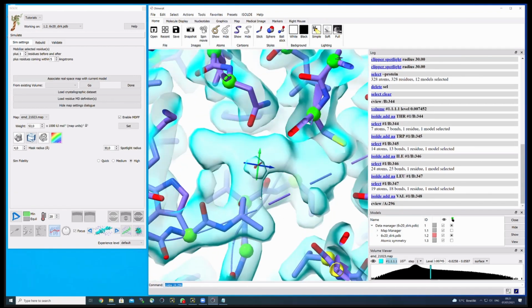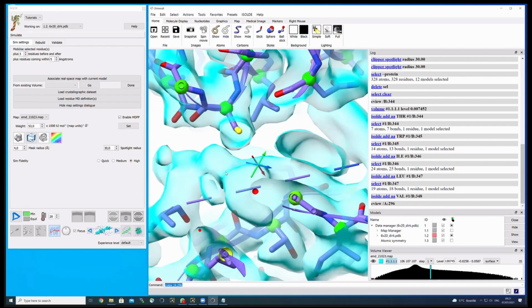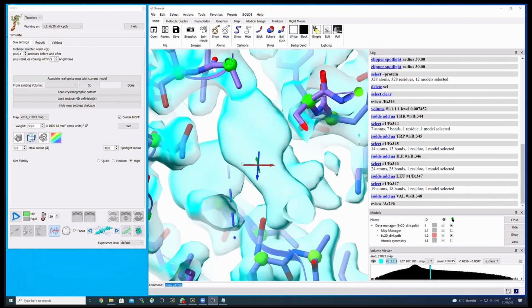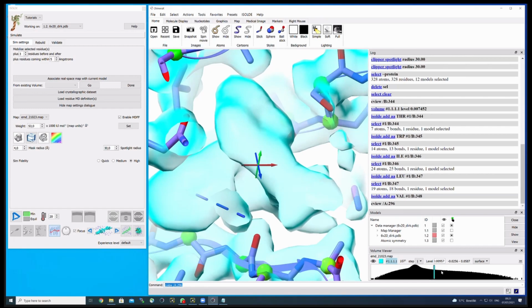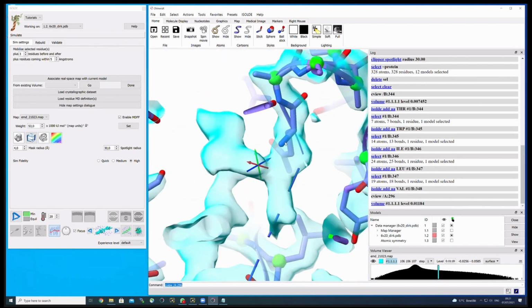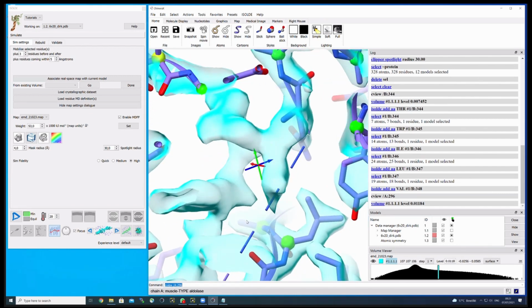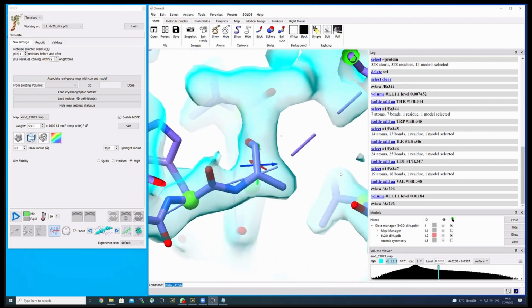And what I did here is, of course, this is what I engineered. This was modeled correctly before, but I deleted a stretch of 10 amino acids, and we can basically follow this chain, how it runs through the protein with its density. Some really, let's say, marker residues are here, which is a tyrosine here. You can start seeing the whole, especially if you play around a little bit with the threshold. You see a phenylalanine here, so some really nice marker residues, and it continues just to this end terminus. And this is also indicated by the dashed line, which in ChimeraX highlights a pseudo bond.